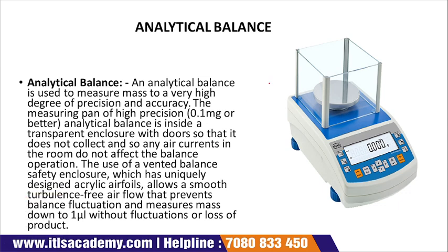The second instrument is the analytical balance. The analytical balance is used for weighing the sample. This is your digital analytical balance. We use the analytical balance because it gives a high precision, accurate result.